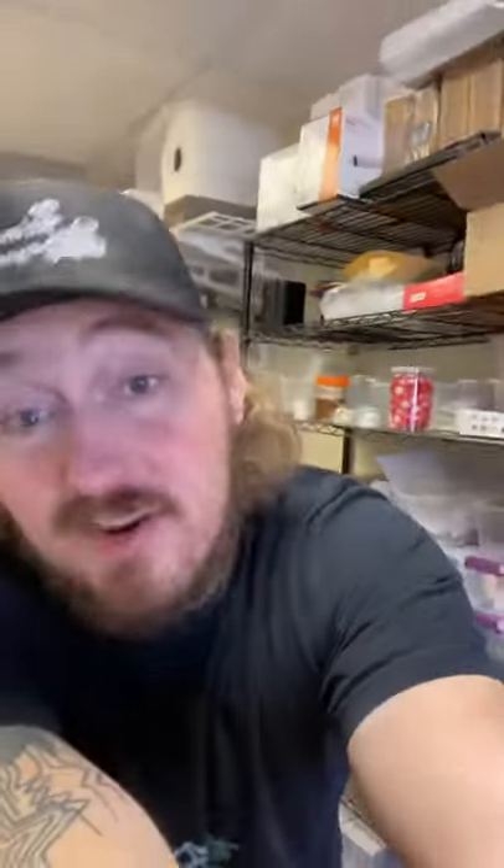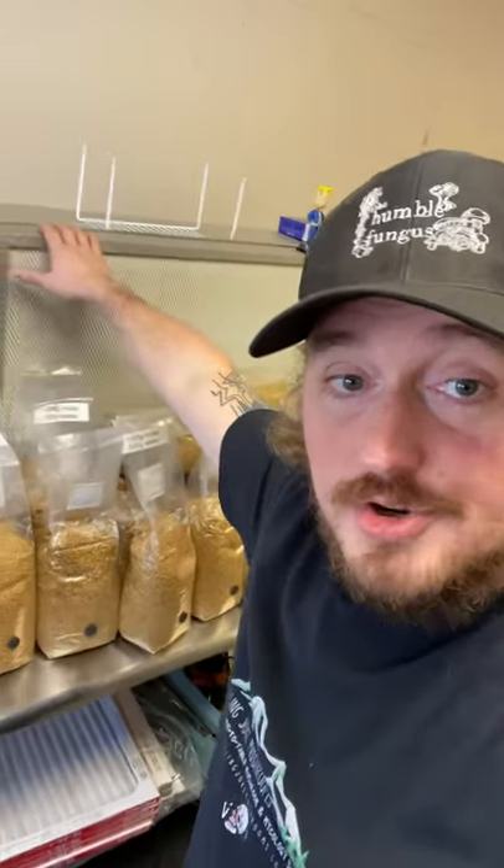You can build one, but the filters — if you were to buy a filter that size and try to pair it with your own fan — I would imagine the filter alone would be $500 or more. We're talking like $800 worth of HEPA filter before you buy the necessary fan, power, the box, etc. And the box you're going to be building for something like this, it's going to look like an organ. I built them. So anyway, check out eBay, check out Craigslist — you're looking for clean room fan filter units. If you're near a city like I am, there's a place in Denver called Modular Clean Rooms of Denver. You probably have someplace around you like that. You can get one of these for $400 to $600 before shipping.